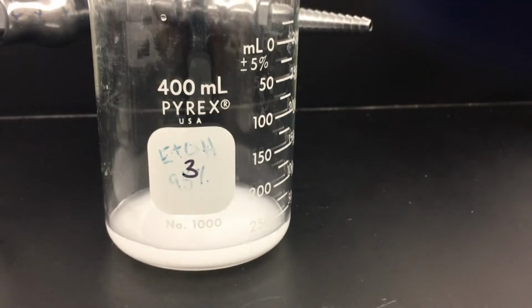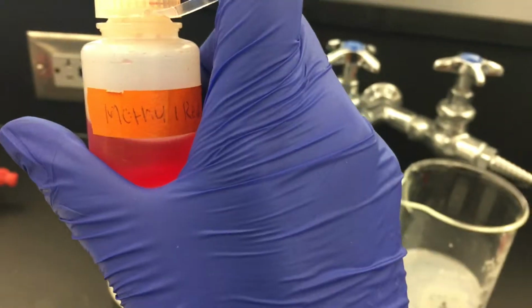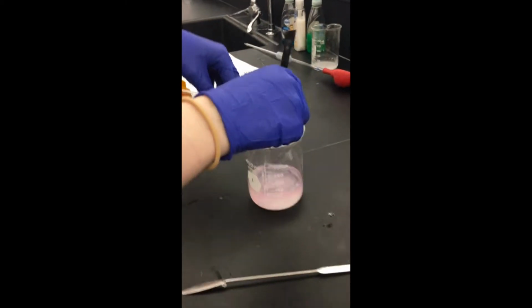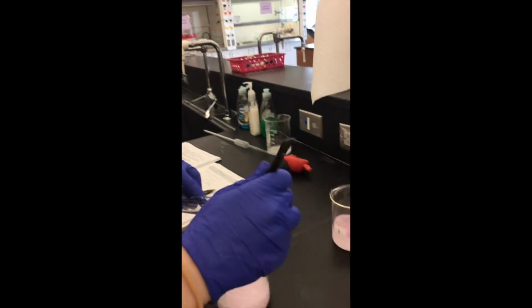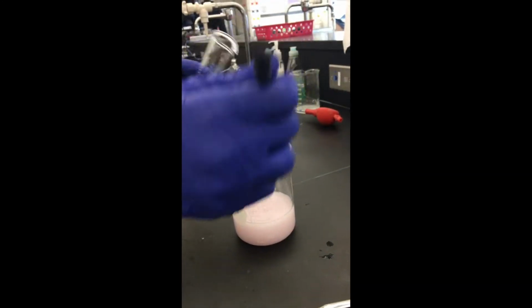Rinse a 25 ml volumetric pipette once and transfer 25 ml of solution into each beaker. Add about 75 ml of 0.1 molar HCl to each beaker. Next, add 5 drops of methyl red to each beaker. Next, add about 25 milliliters of 4% ammonium oxalate solution to each beaker, stirring with a glass stirring rod. Save about 5 milliliters to rinse your stirring rod and get all the solution off.